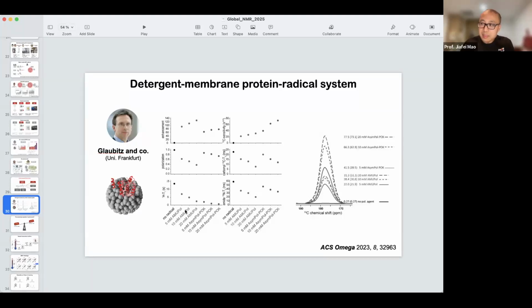But in some cases, when you can't have enough sample to set up optimization, what we can do is a guess. All the experience goes to more like 10 to 20 millimolar radical concentration. And the glycerol concentration depends on your sample character first. You can't destroy the sample in the first place by adding glycerol, right?